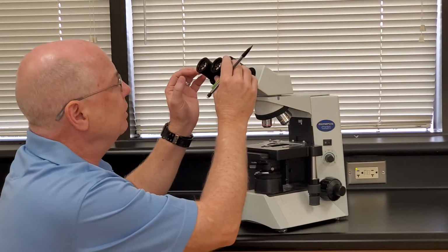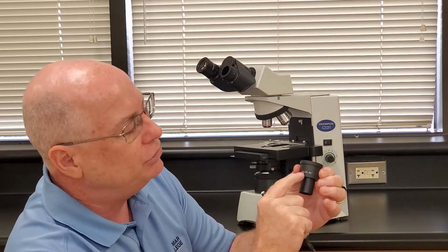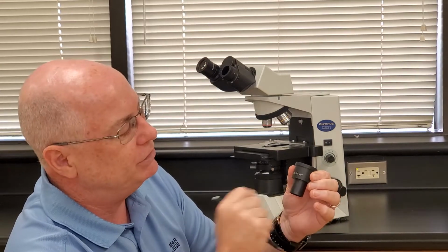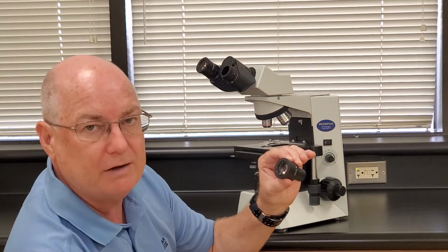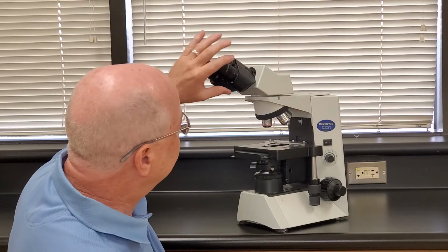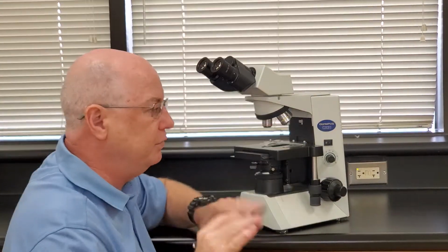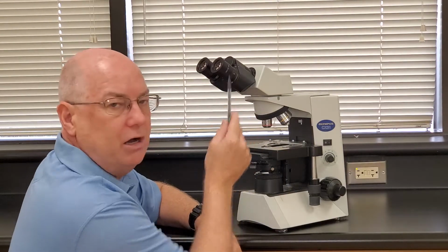Now, when we look at the ocular or the eyepiece, don't ever take one out of a scope. I did, but you shouldn't do that. But if I look at them, they have some numbers on them, and one of those numbers says 10x, the other number says 20, and the 10x tells you how many times this little piece of glass will magnify something. So if I simply look through this and look at my hand, it will appear 10 times larger than it really is. The other number tells you the field size, the size of how big of the area that you can see. We're not concerned with that. So these are the oculars.